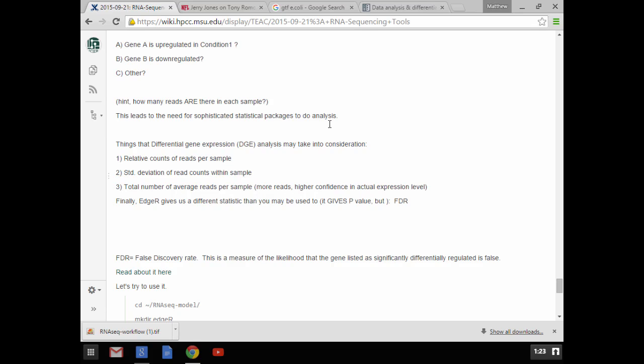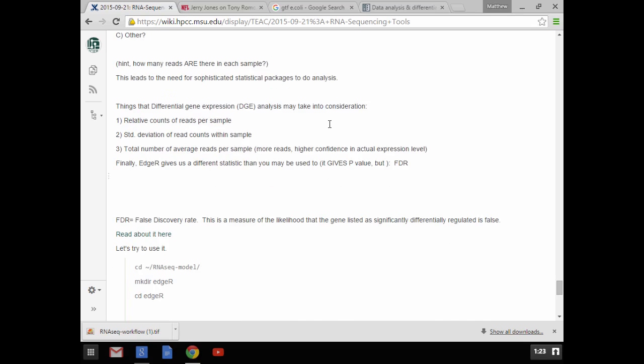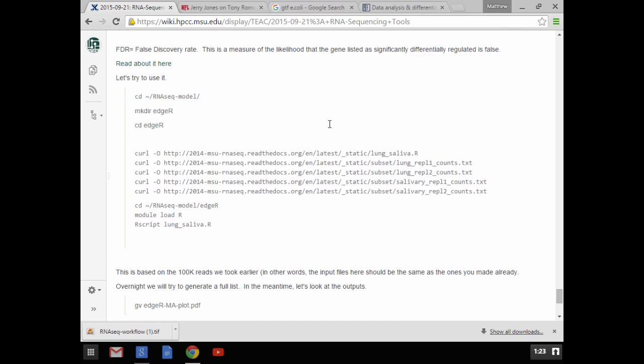So I recommend highly when you get charts out of EdgeR or DE-Seq, or I think CuffDiff gives it as well, you use the false discovery rate rather than the p-value. You'll have to explain it every time you give a presentation to people who aren't used to it, but it's worth it. You can give them the p-values in the presentation if you want to, although I'd recommend against that as well, because then they'll ask you questions about why you picked one with a p-value that was so high when the false discovery was so low, and then you have to explain it all over again.